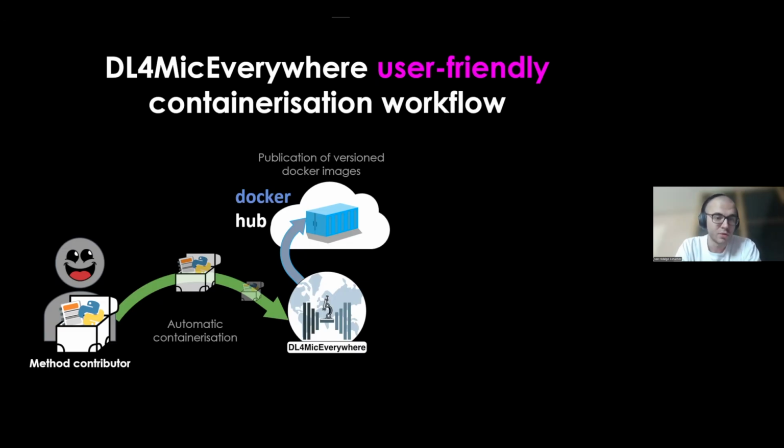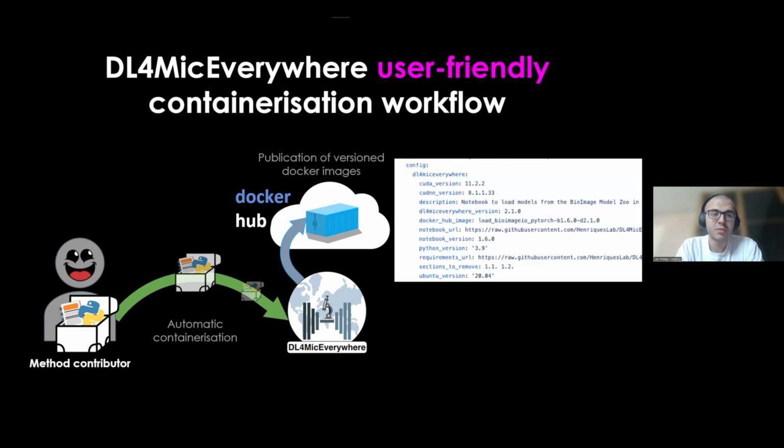How can you contribute to DeepLearning for MicEverywhere? Imagine that you have the notebook. How can you access this automatic containerization? We try to do it in the simplest way possible. You just need to contribute to the DeepLearning for MicEverywhere GitHub repository with this configuration YAML file, and in it you need to specify some details.